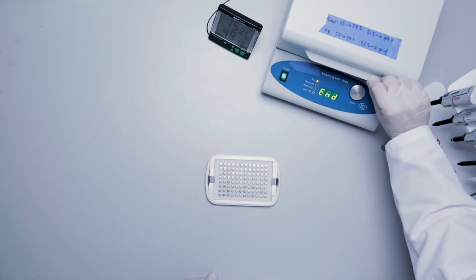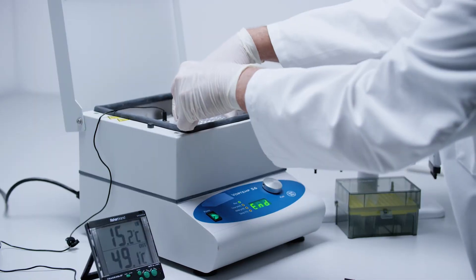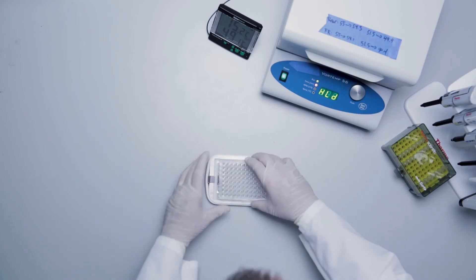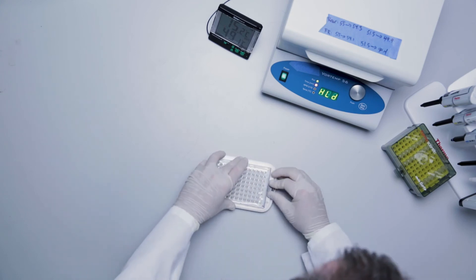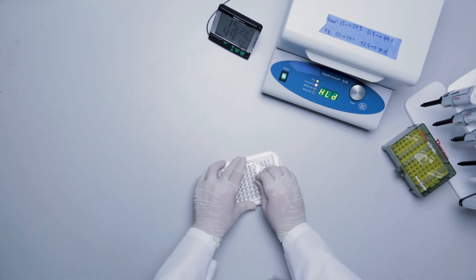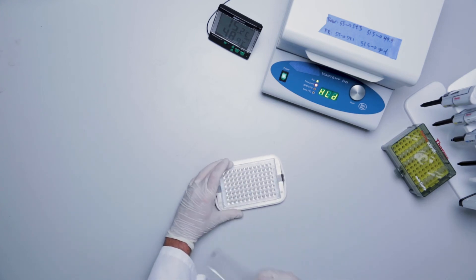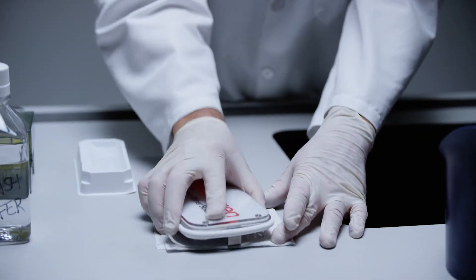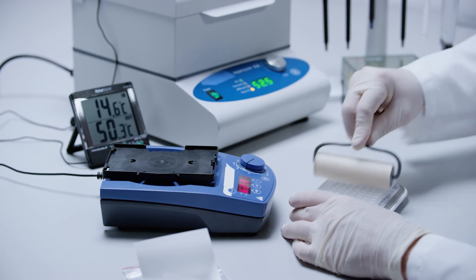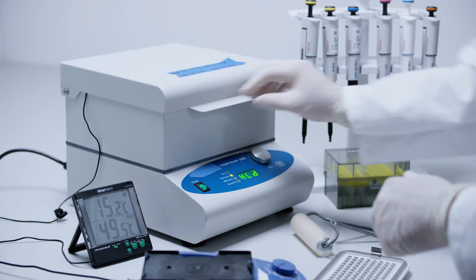After pre-amplifier incubation, remove the magnetic separation plate from the shaking incubator and turn the Vortemp back on. Insert the plate into the handheld magnetic plate washer, remove and discard the seal, and repeat the washing procedure with wash buffer as shown previously. Repeat these steps for the addition of the amplifier and the label probe solutions. Make sure to wash with wash buffer after the incubation is completed for each of these reagents.